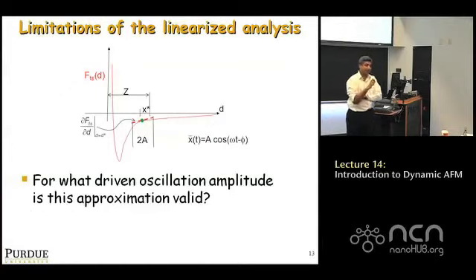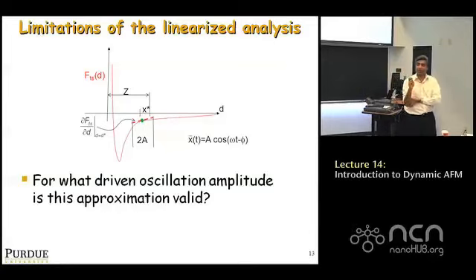Okay, so I want to just conclude with a very big caveat. This understanding is great, this zeroth order understanding of dynamic AFM with the tip sample interaction force is very simple, but the question is, what is the assumption inside it? And ultimately the assumption is this, right?